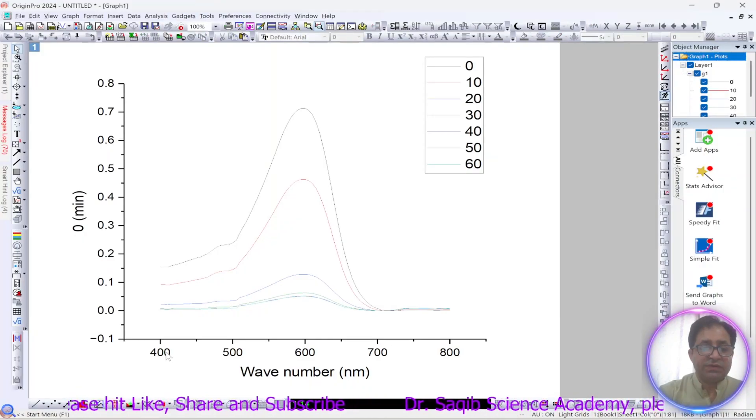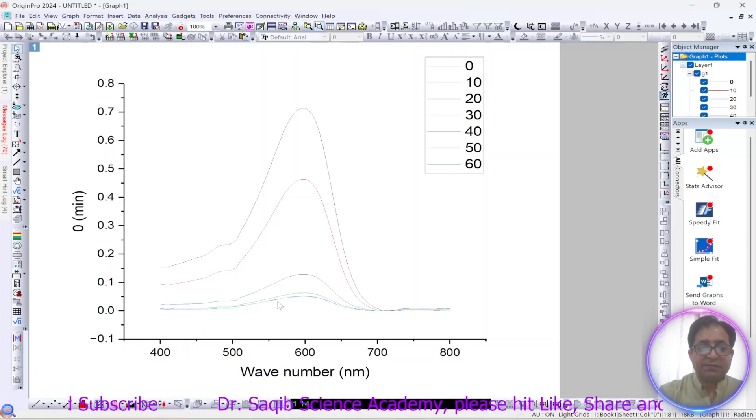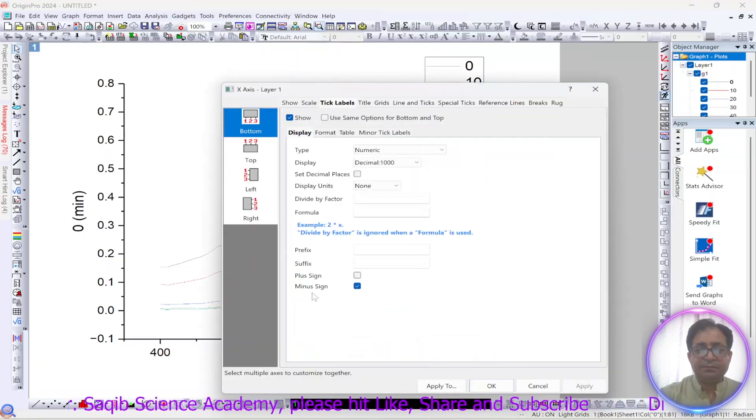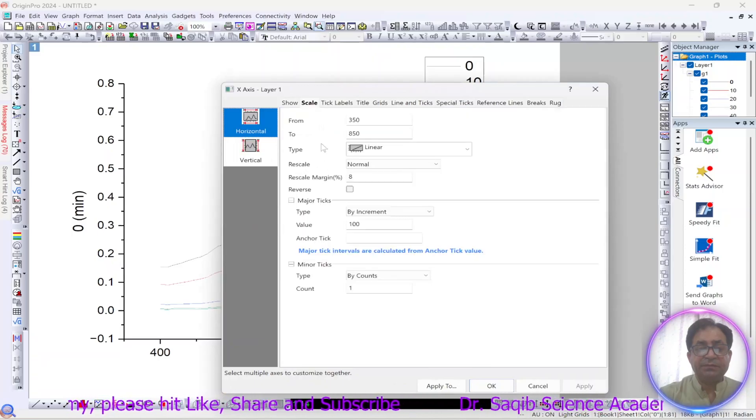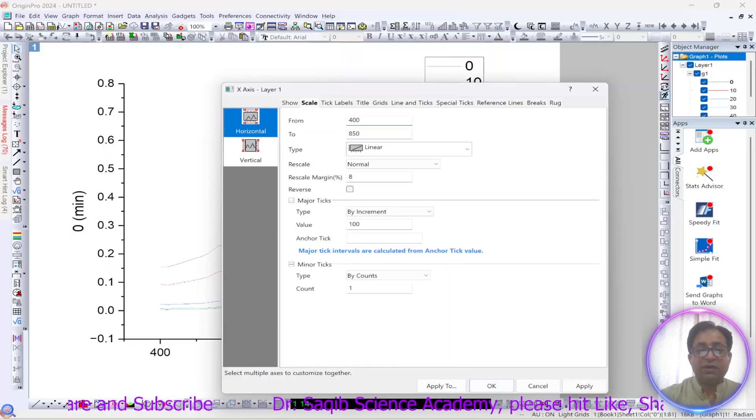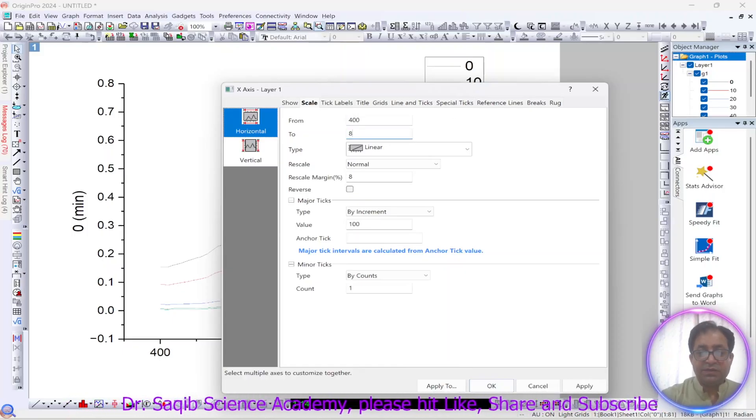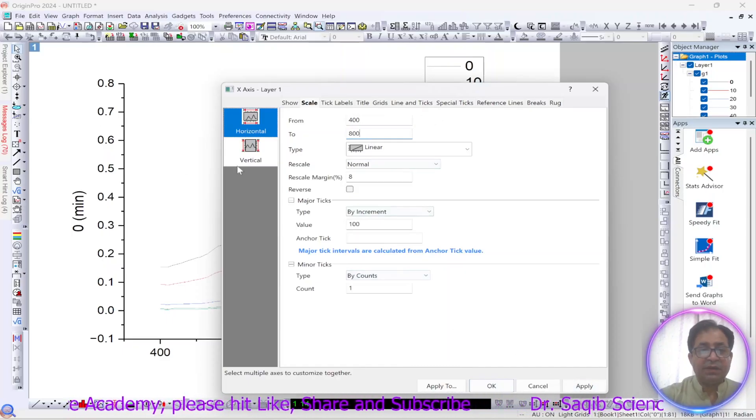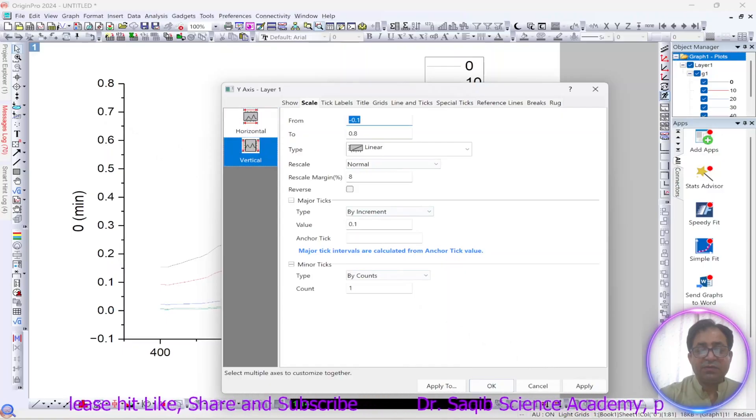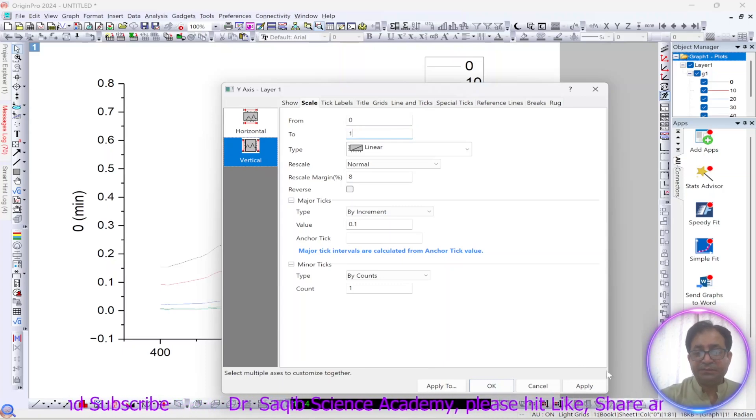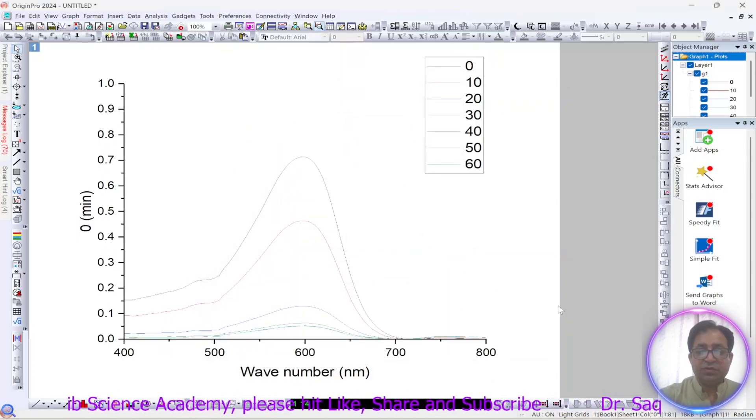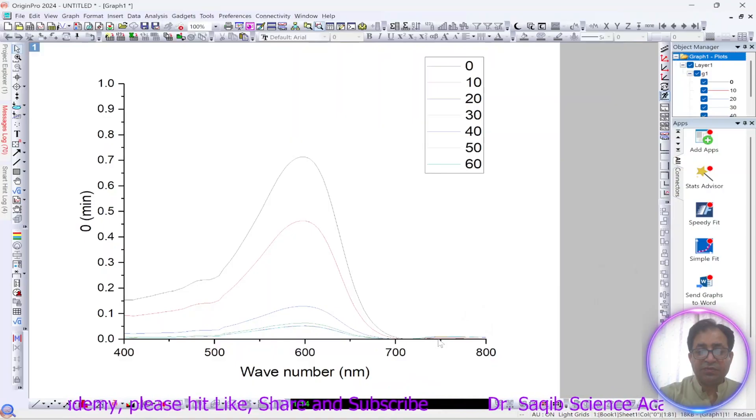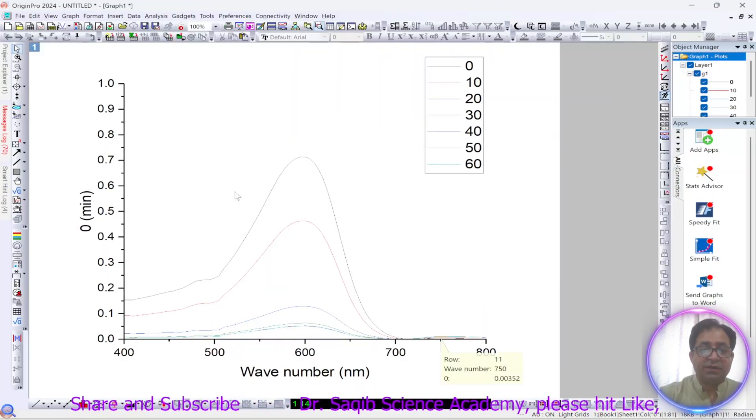What we have to do, we will first set our x axis from 400. Over here we will go to the scale on horizontal axis. We want to start it from 400 till 800 and the vertical axis or y axis we want to start it from 0 till 1, apply. So it will show us like this. We can also do it till 750 but I think 800 is okay.